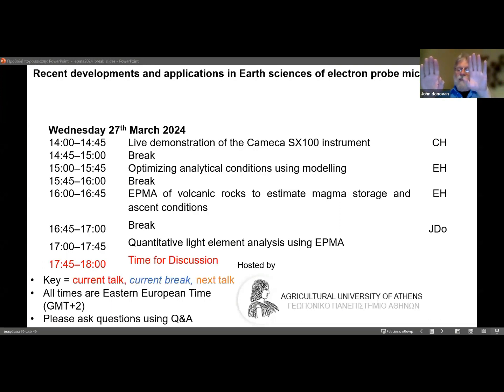And when we combine them, we take the counts from one spectrometer and the counts from the other spectrometer for the on peak, and we add them together. And we do that for the off peak, the low off peak and the high off peak. Basically, we do it for every type of data that we acquire, including TDI, by the way.